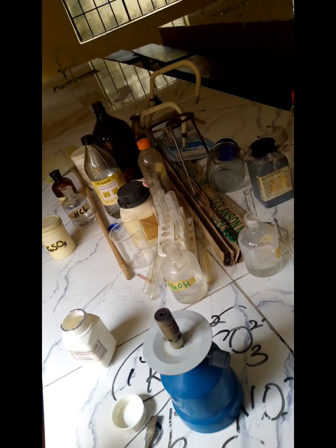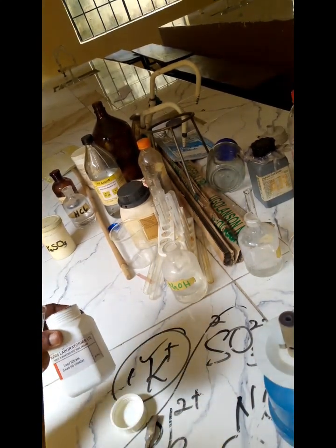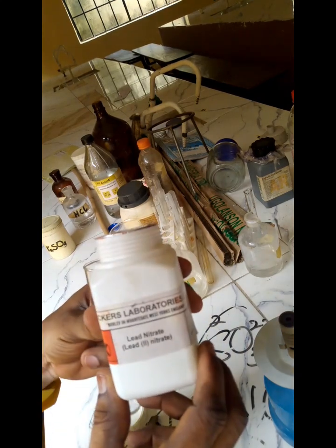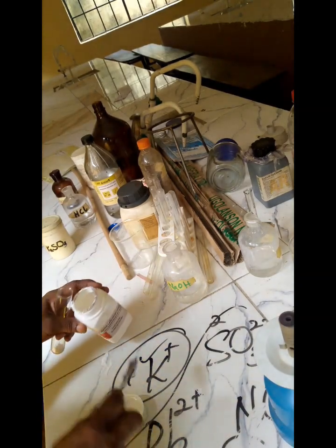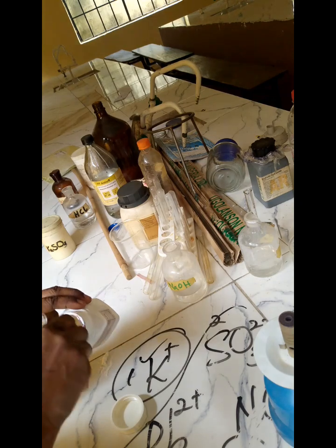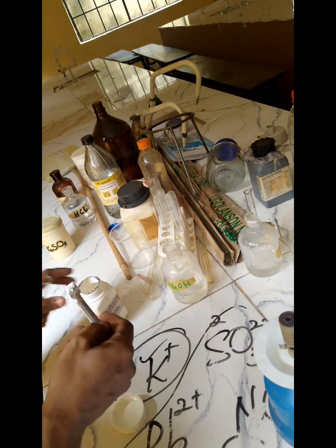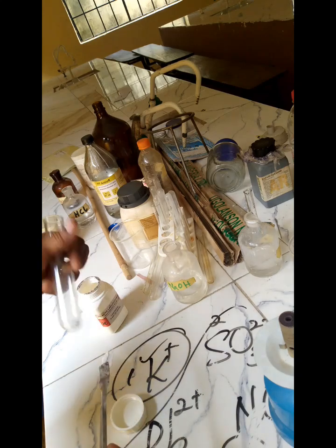Now let's identify the nitrate in lead nitrate. This is lead nitrate. Let's see what the outcome will be. All we need to do is collect some quantity of the salt into a boiling tube. These are boiling tubes.